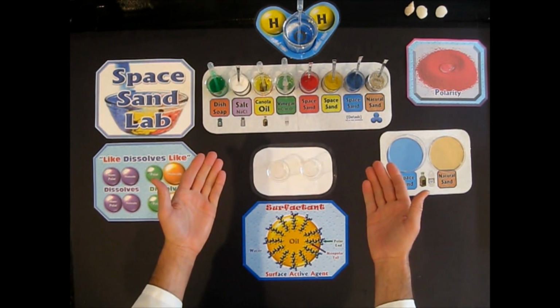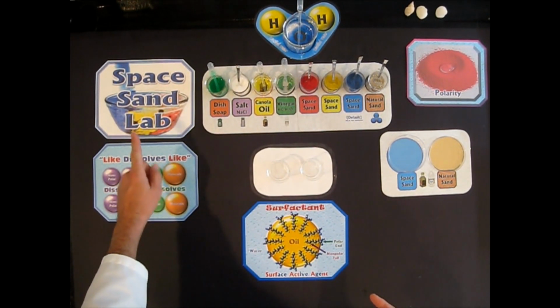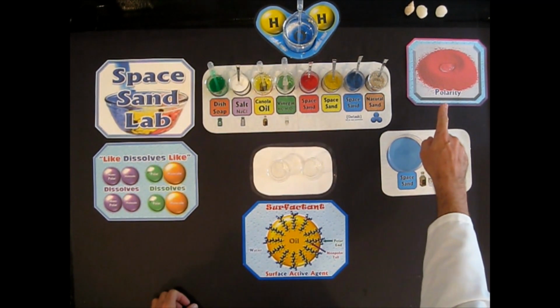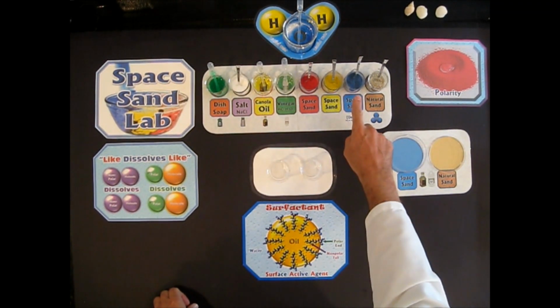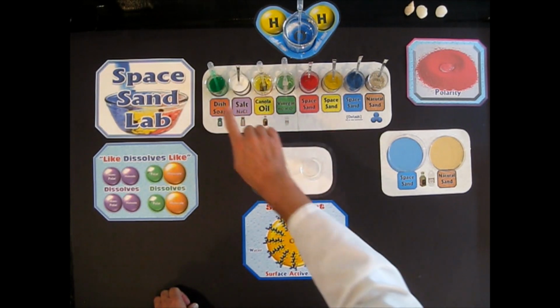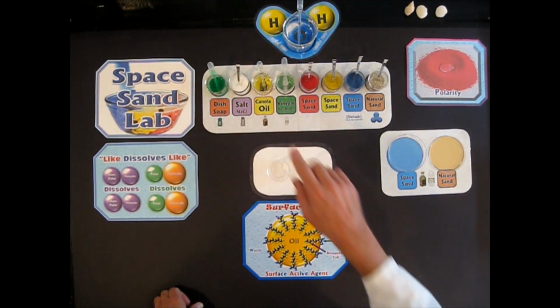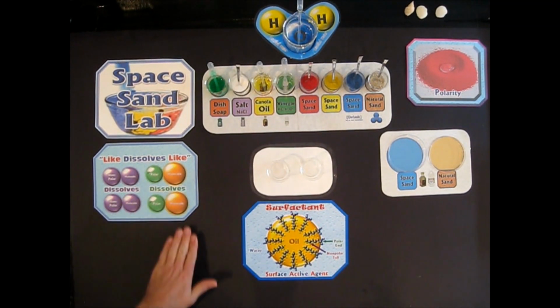Okay, so we are going to be doing the Space Sand Lab. We're going to be examining polarity and solubility. We're going to be using, of course, space sand, 3 different colors, natural sand, and then several liquids including water and salt. We're going to be examining what mixes.